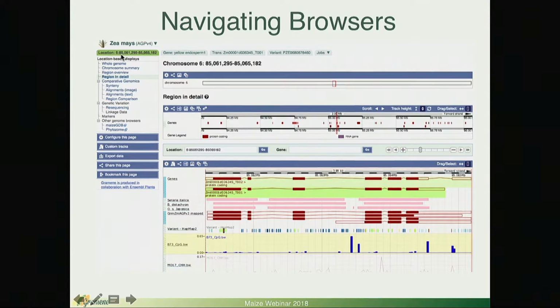You'll see that when you look for a gene, you're going to be given a location tab, which has contextual information for your gene of interest or for any given region in the genome. You can also have the gene tab, a transcript tab for any particular transcript for that gene, and you can have a variant tab for a single nucleotide polymorphism as well as a structural variant.